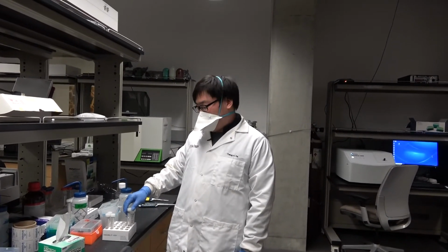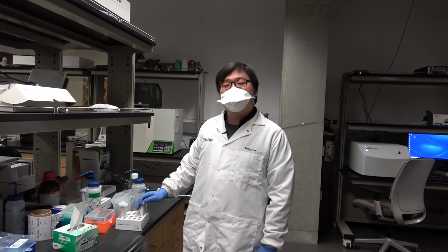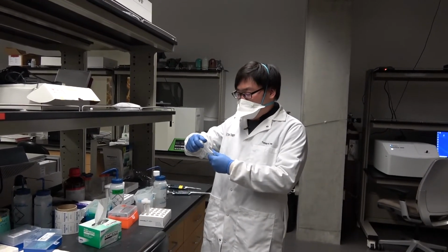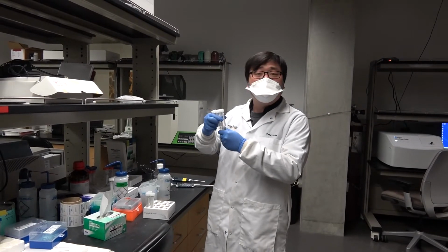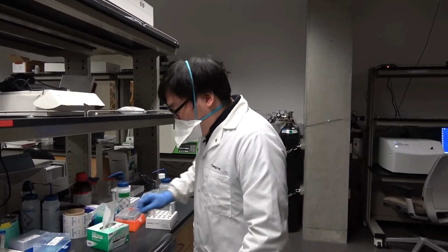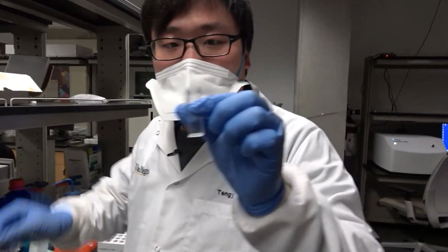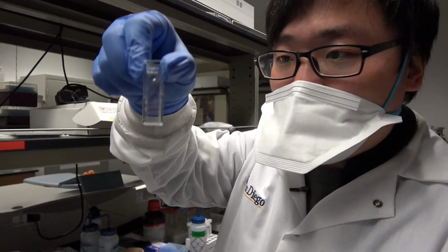So now I'll be demonstrating how to use MANTA to measure the size of 3 silica samples we synthesized. The 3 tubes contain 3 different sizes, and we will confirm these later with MANTA. Here is a cuvette I'm going to use. It's made of quartz, so you can see four transparent walls.